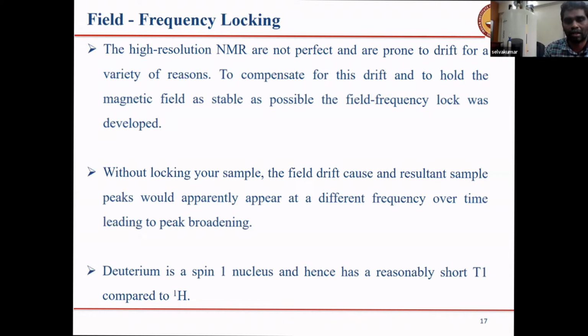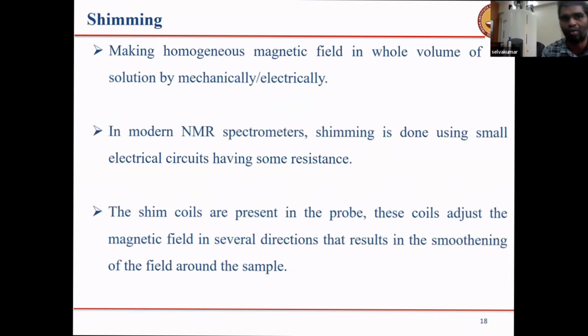Its T1 is comparatively very low compared to proton. Sorry, lower T1 value. So that's why we are using deuterium locking. Once locking is done, shimming. Already I told so many times, shimming. Okay, shimming. What is shimming?